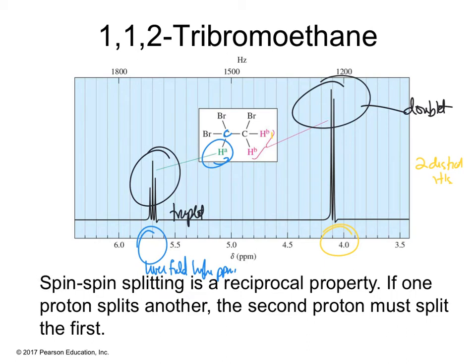And now, the thing is though, these neighbors here, the red hydrogen has how many green hydrogen neighbors? The green hydrogen, it has 1, right? 1 green hydrogen. So what's the n plus 1? 1 plus 1 is 2. That's a doublet, okay? So the doublet belongs to the red hydrogens. The 2 red hydrogens is the doublet because its neighbor only has 1 and it's splitting it.